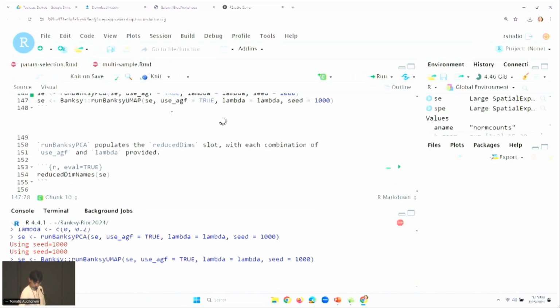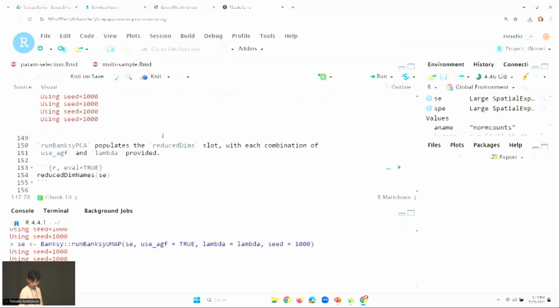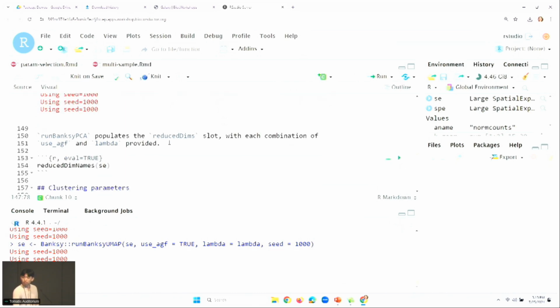One is using the Banksy matrix as an input into existing deep learning spatial frameworks and seeing if we can improve things that way. The other is taking the embeddings learned by existing deep learning frameworks, including image type embeddings, not genomic data set type image data set, and appending those to the Banksy matrix. So both directions: feeding the Banksy matrix in or constructing a non-genomic informed Banksy matrix.